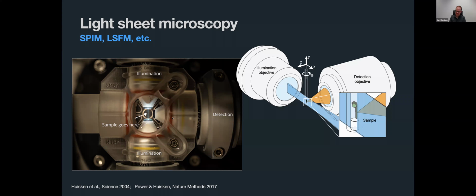Because every Flamingo has the same data format, we would also hope that we can form a community around these Flamingos where people help each other with their data processing needs, right? I'm sure there are a lot of people who can help out with processing the data, especially if it's sitting in a cloud and multiple people can have access to it, and find solutions for how to process the data.